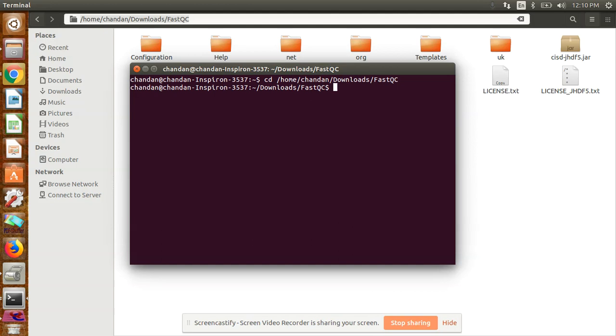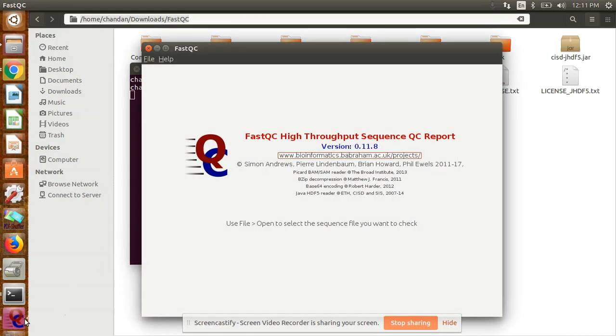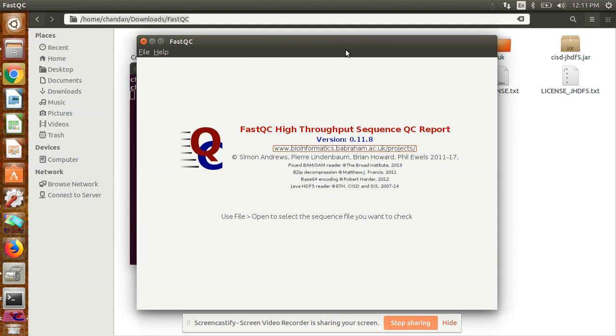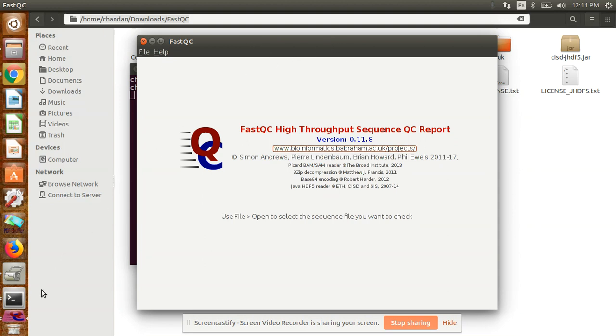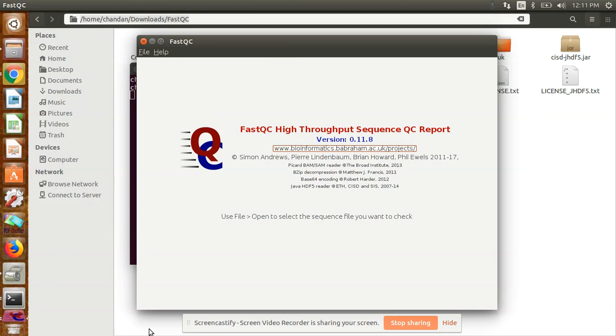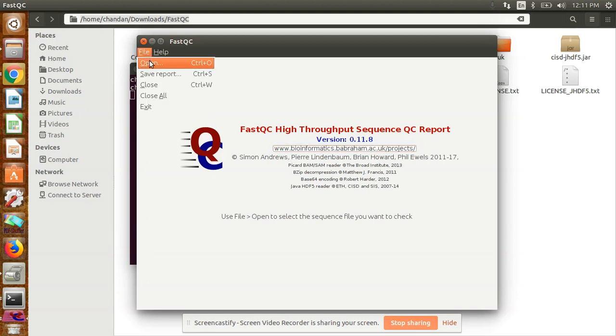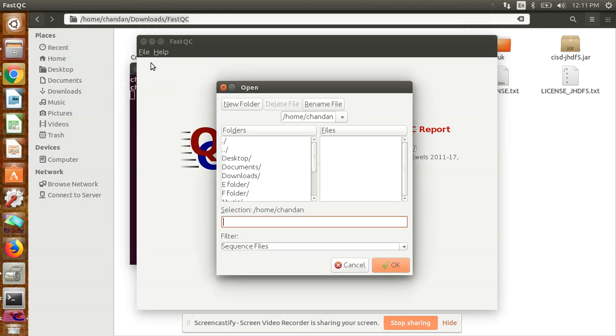Open terminal, change directory with this command, paste the path, and for starting FastQC, the command is dot slash FastQC, then enter. Now your FastQC is open. This software you have to use for checking the quality.